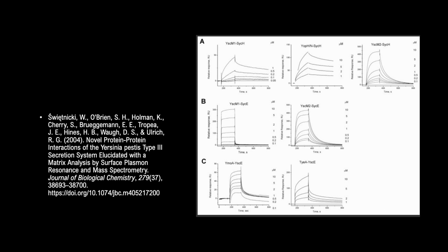And then the resulting sensorgrams in the image show the association and dissociation phases of the interactions as they change in the refractive index. Overall, this image is showing that the sensorgram was able to see that there were select protein pairs exhibiting strong interaction.